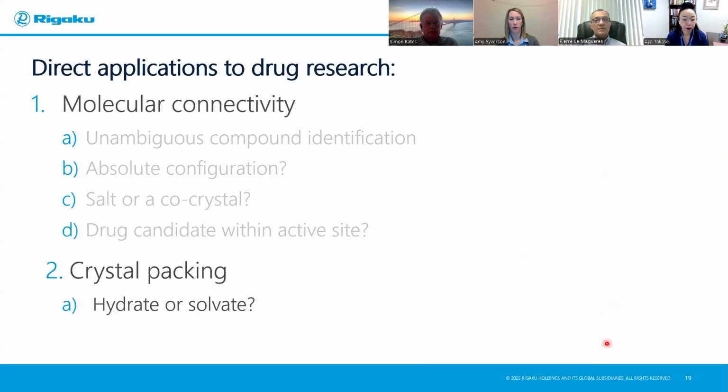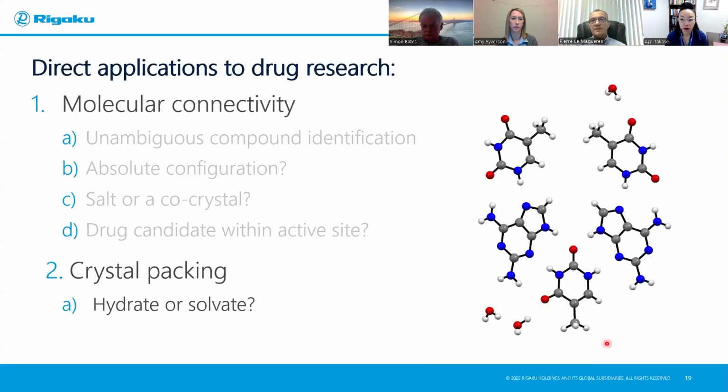It is by studying the crystal packing that you can assess whether solvent or water molecules have been caught within the crystal lattice. And here is an example of it. Two different molecules, which I'm surrounding with my cursor here and one there, have co-crystallized by catching a few water molecules within the crystal lattice. So here, the crystal structure, again, told us that we have a hydrate.